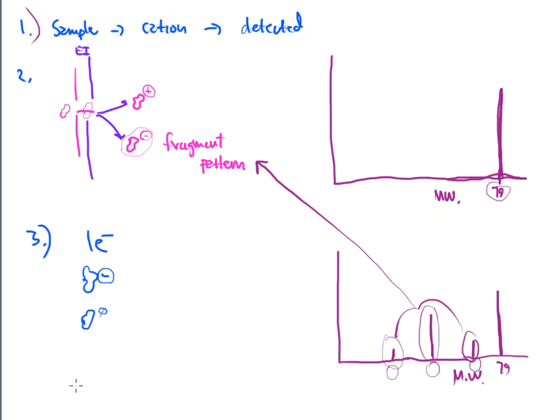We got to get rid of those. The only way that this mass spectrometer works is by looking at the positively charged species. If it's not positively charged, too bad. It's never going to see the daylight of the tunnel at the end. So all three of these cases have to be sucked out of the instrument.